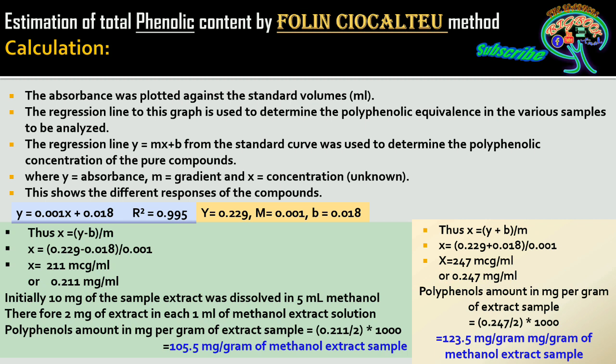We can discuss the enormous number of calculating methods and phenolic extraction methods for this colorimetric method. Apart from this, there are thin layer chromatographic methods for the estimation of polyphenols and phenols also.